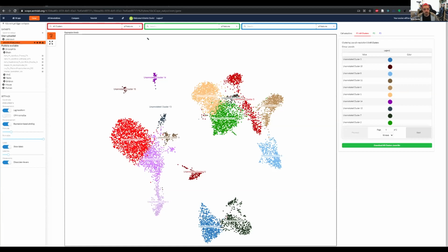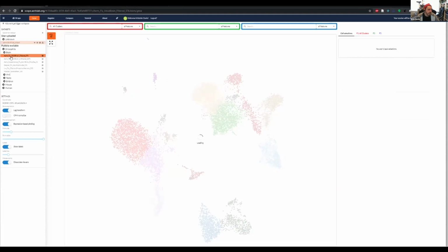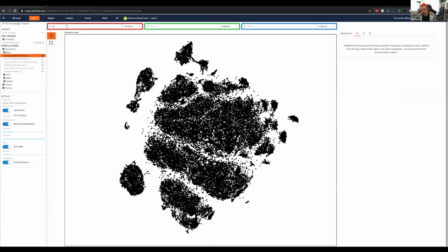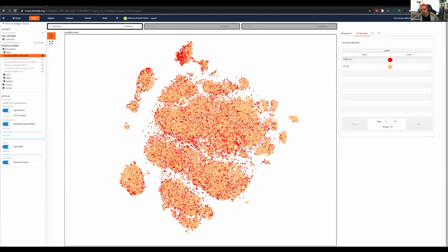Those results again can come to Scope, and then you can see, for example, which samples you've included. Normally you would then be able to, I think I can show that here. As a proxy, I will show genotype. I can't type today, genotype. You'll see that you've got the two colors here, one for the two different genotypes we have. If you ran through Vision with one of the batch corrections, you would have sample or batch, and these would show up as the different values that came in, typically the sample names, and you'd be able to at least see where your original samples were.